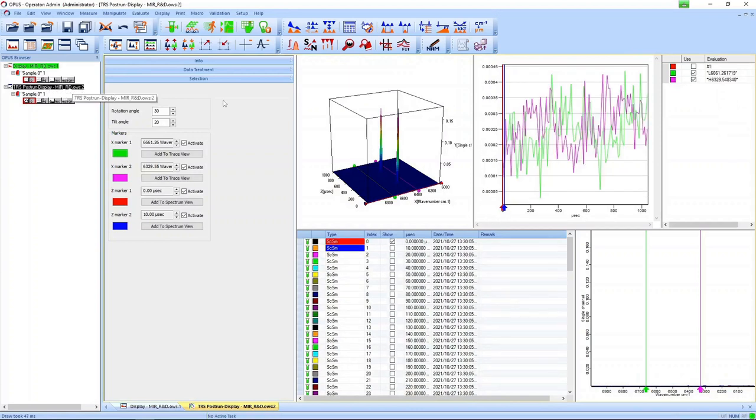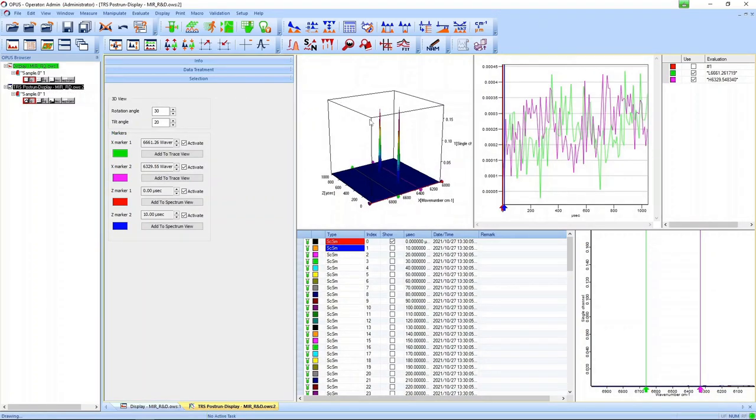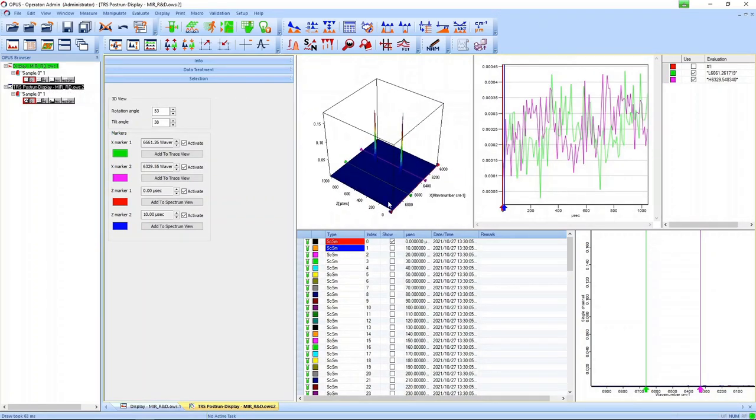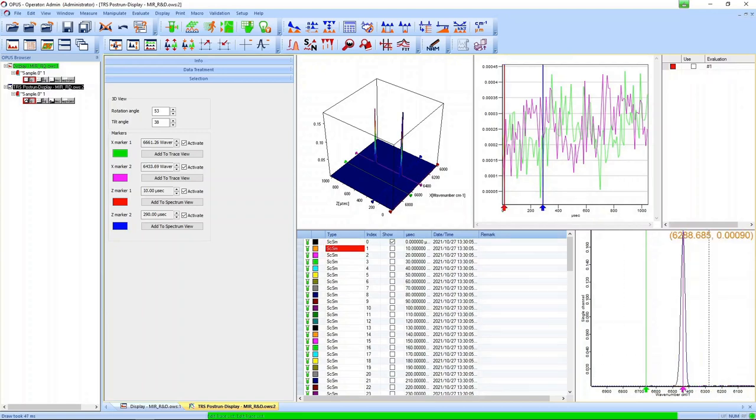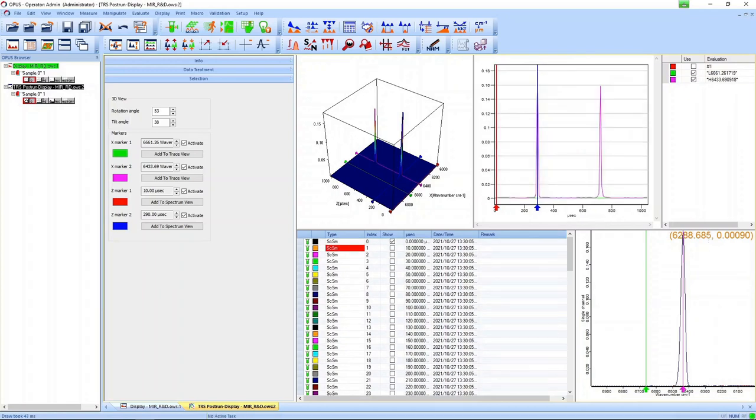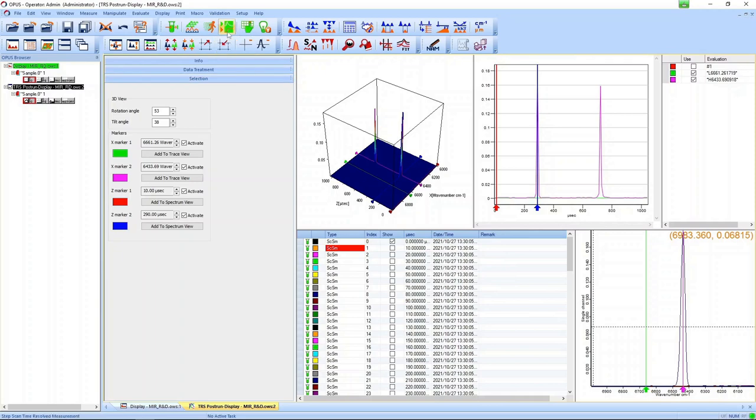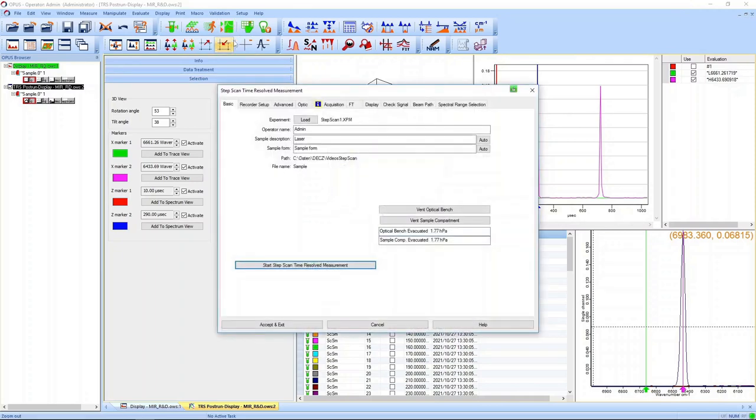After the measurement finished we open the result and see two pulses. We can zoom into the spectral region and see that the pulses are located around 6450 wavenumbers. In the temporal profile the pulses appear very sharp. We want to change this.